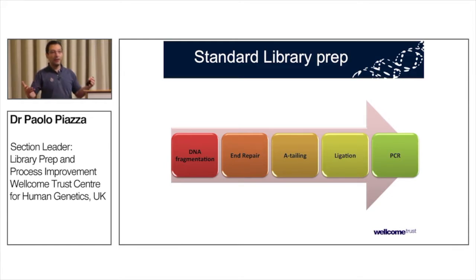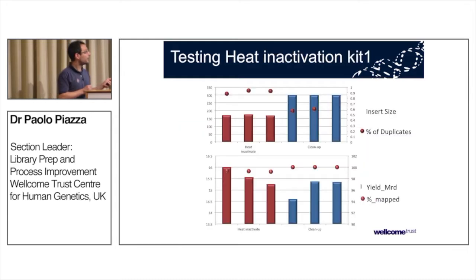So if you get large-scale batches of samples extracted by other people with a mixture of different genomes, it can be a nightmare to resolve it with just Nextera. So there's a few good reasons behind this choice. Sorry for the busy slide.